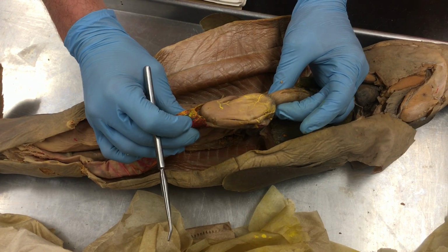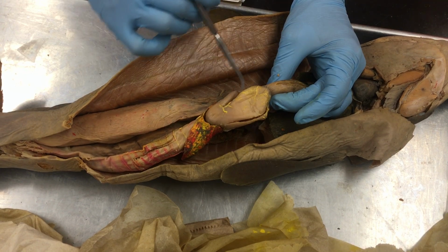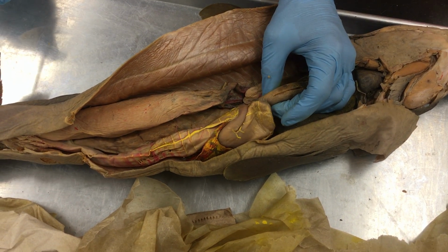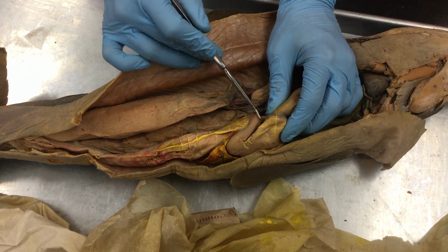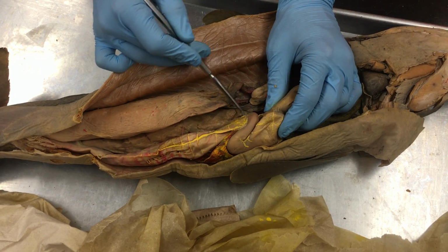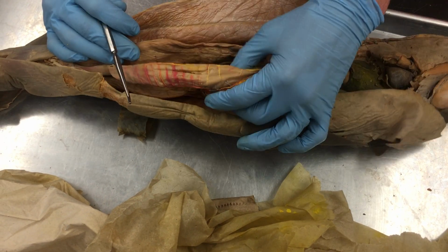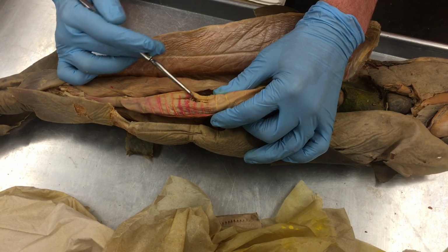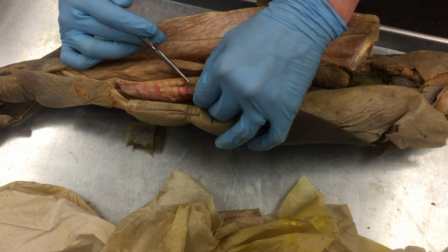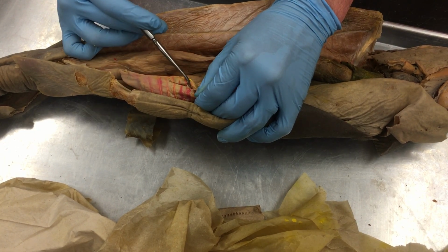Greater and lesser curvature. I think this one's the greater, this one's the lesser. Might have to double check that though. So pylorus again, this region, specifically where this curve happens. Spiral intestine is here. Can't really see the spiral valves in mine because there's a bunch of food in it, but it's all these flaps.